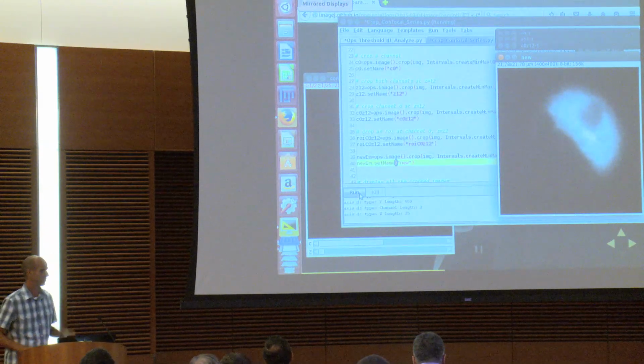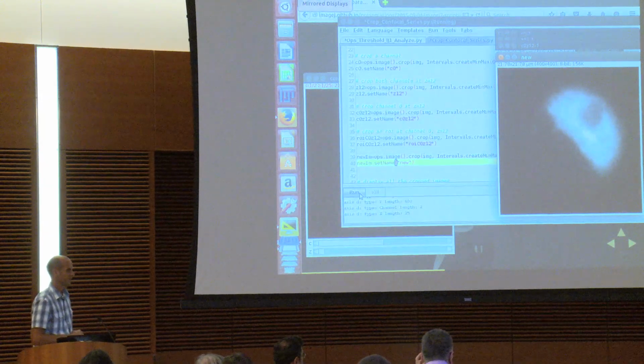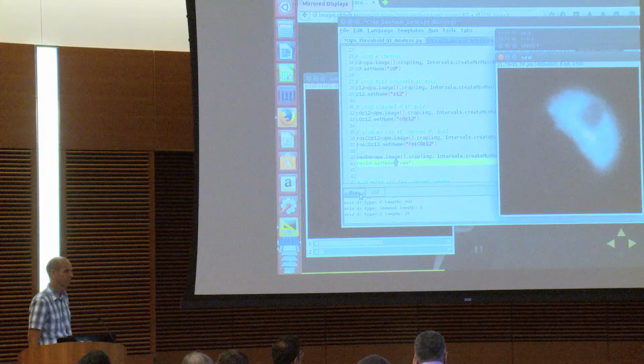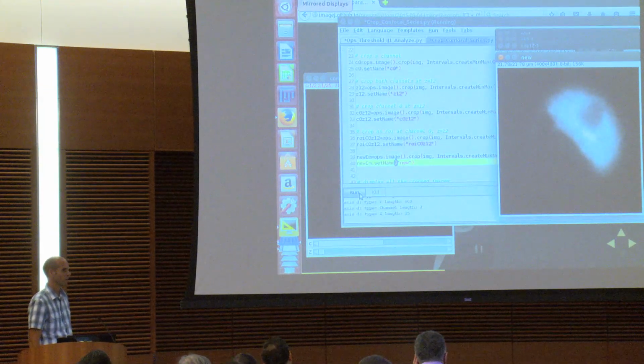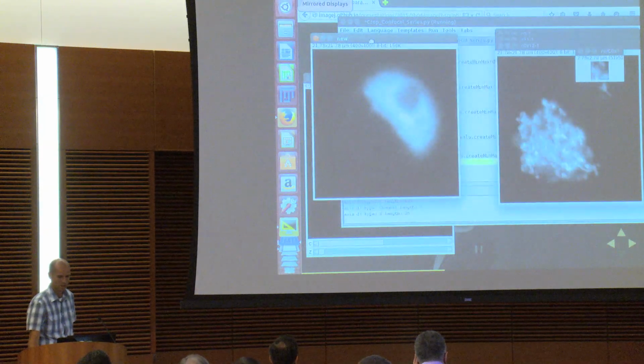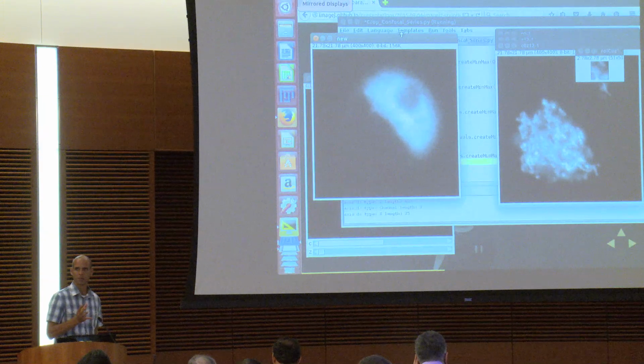So go ahead. The data set itself is the crop data set. Actually, I don't know. I'd have to print it out, because I know it's supposed to be reduced to two-dimensional, but sometimes you end up with dimensions with length 1.